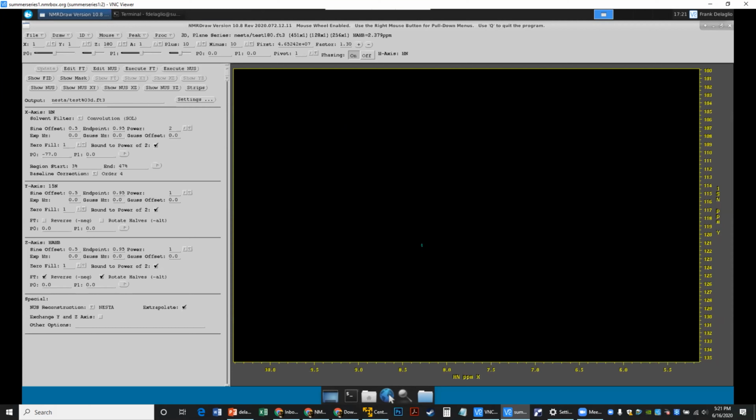Okay. So that is my overview of non-uniform sampling reconstruction. Are there any additional questions before we go on? Very good.